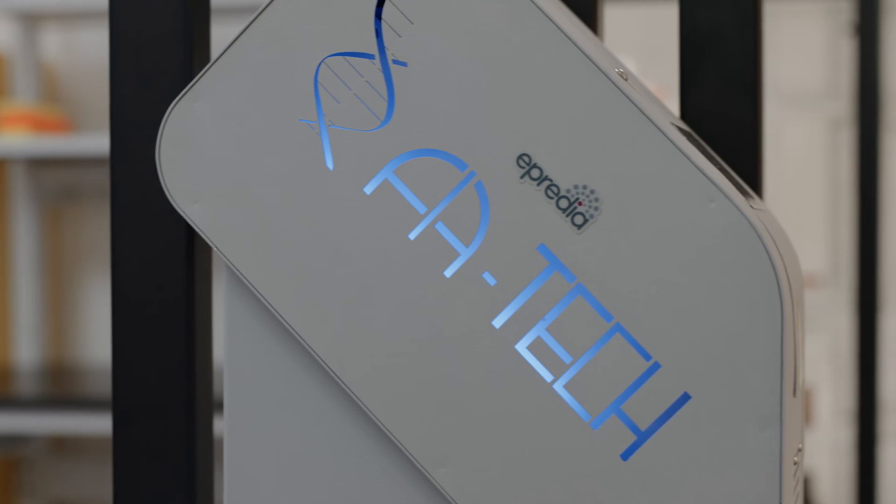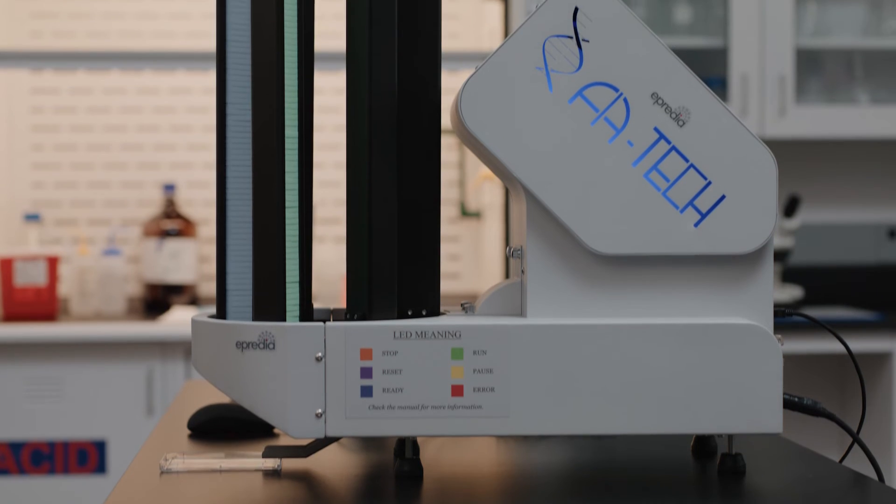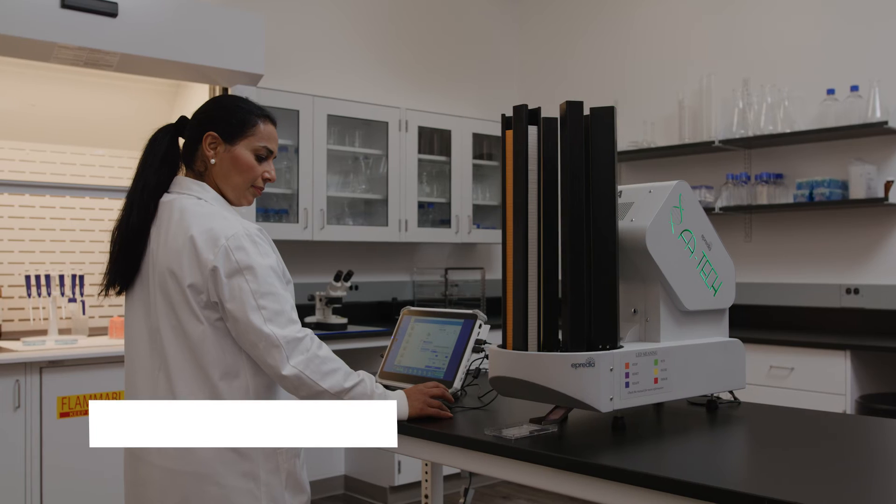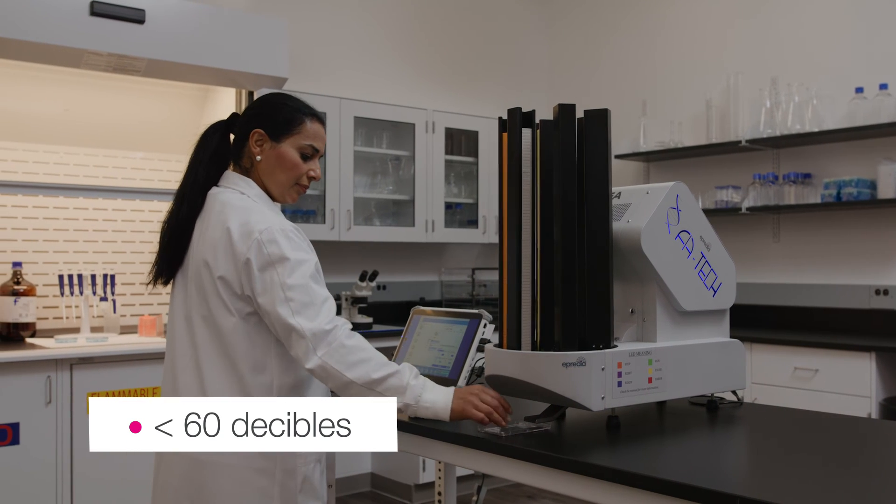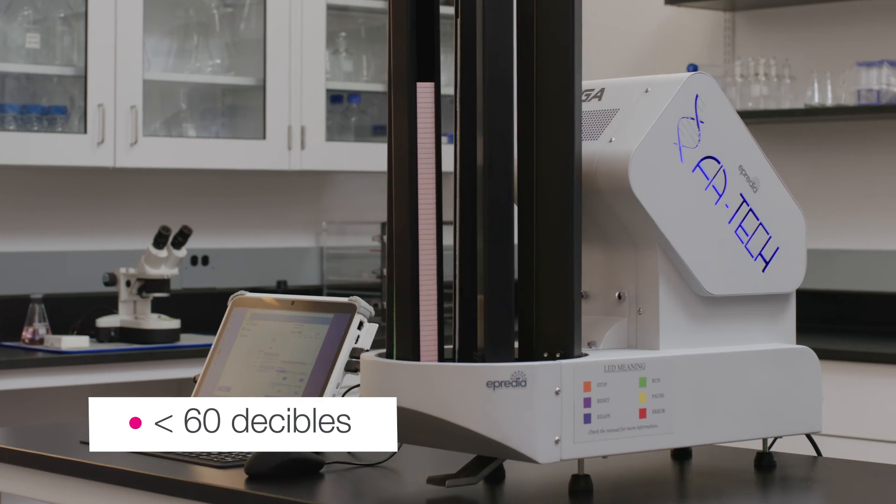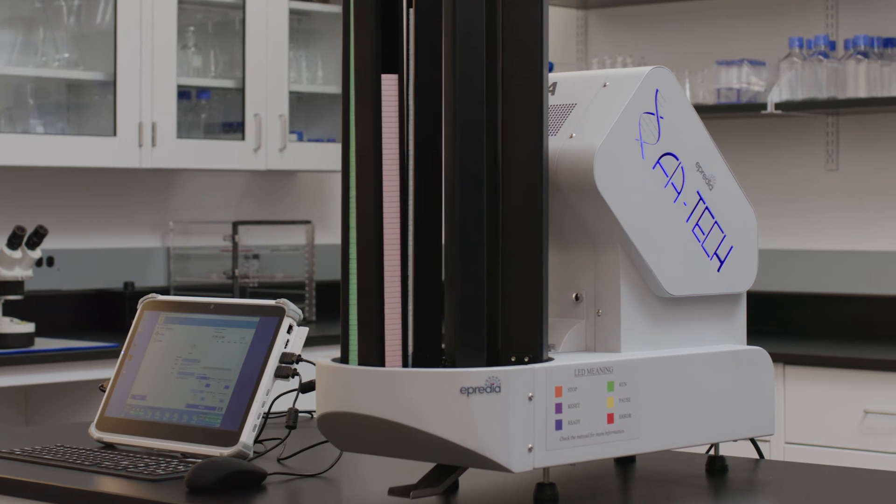The instrument also complies with all laboratory and laser safety regulations. Plus, the system offers quieter operation and a small footprint, so you can use it in areas where you need on-demand printing.